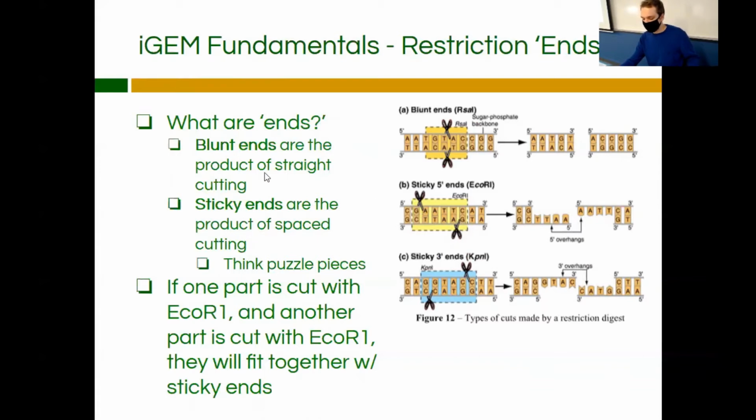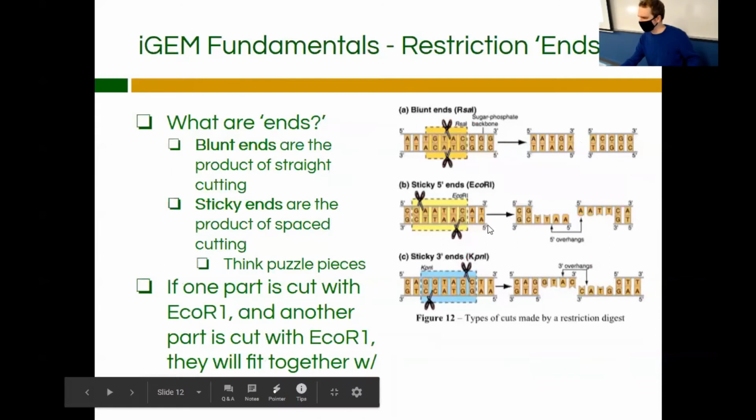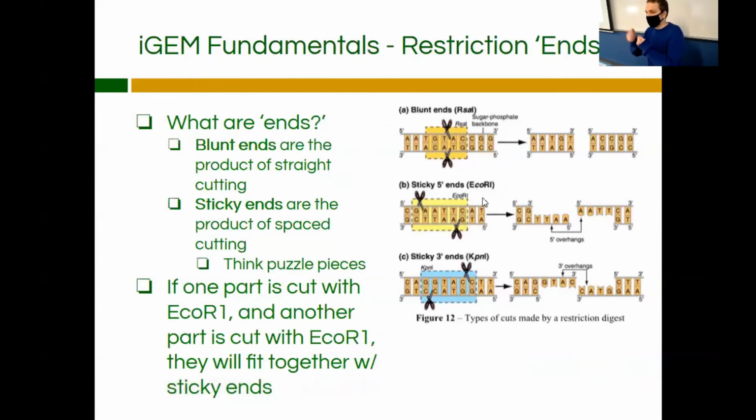And so when you're thinking of this, think of puzzle pieces. When you have 2 puzzle pieces that don't have any holes to snap them together, you're just putting 2 pieces together and it won't stick. But if you have a piece that has a hole and a piece that has the little knob sticking out, and you put them together, they'll stick together and you can hold it. And so this is the basic concept of what's happening here.